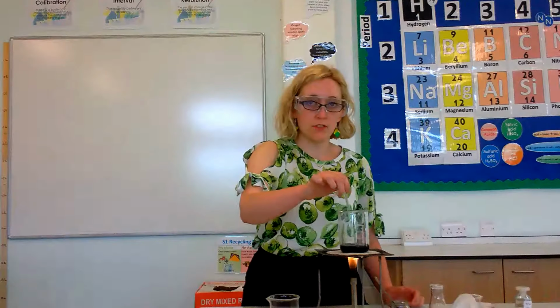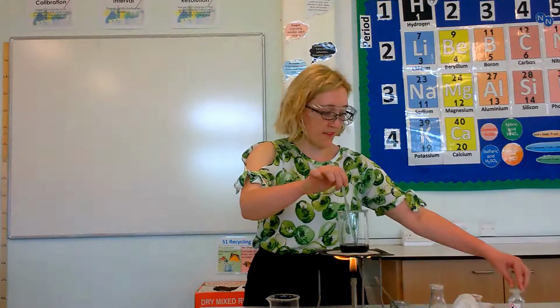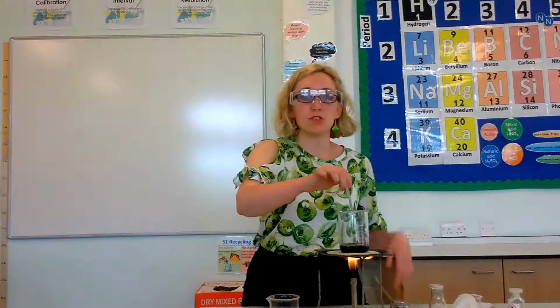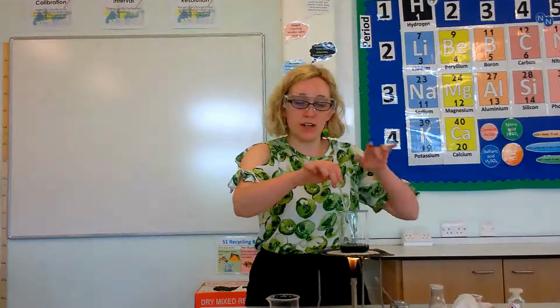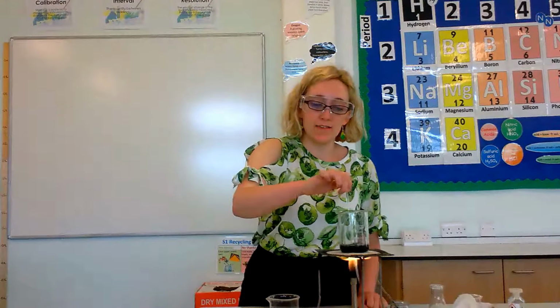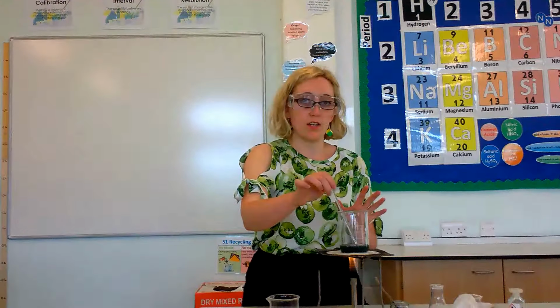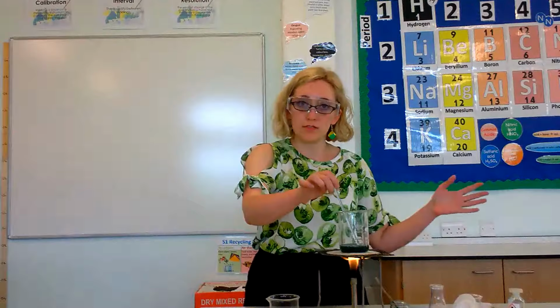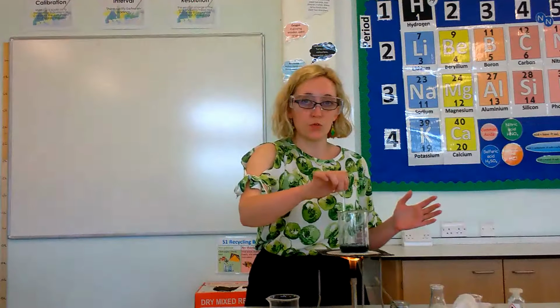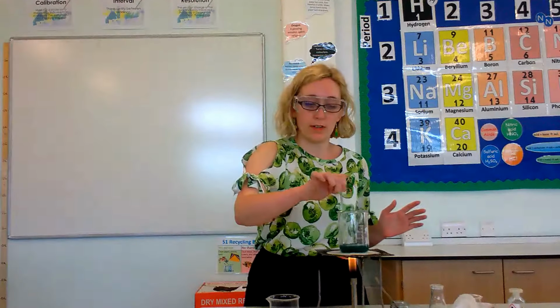In this reaction, what we're producing from our copper oxide and our sulfuric acid is copper sulfate, which is that bluey-green colour, and some water. We don't want to have any unreacted sulfuric acid at the end. The goal of this is to purify copper sulfate crystals, and if you have got acid in that mix when you're trying to evaporate it at the end, it won't work properly.